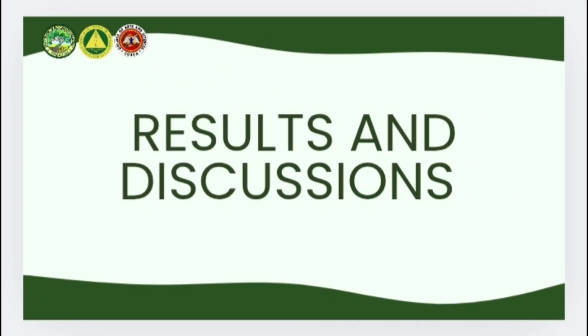The next part of this presentation is about the results and discussions after conducting the experiment, or after observing and viewing the specimens, which is the onion root tip under the microscope.